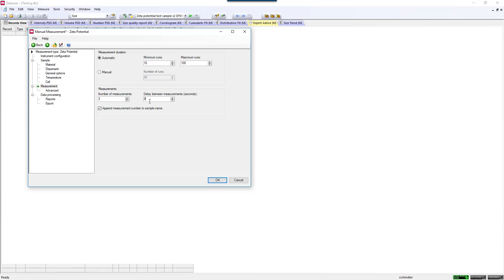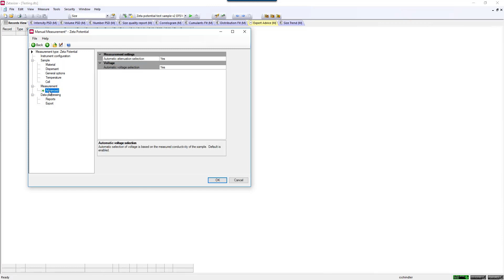You can also put a pause in between measurements if you like. There are other advanced settings that won't be covered here. These are for the manual settings.